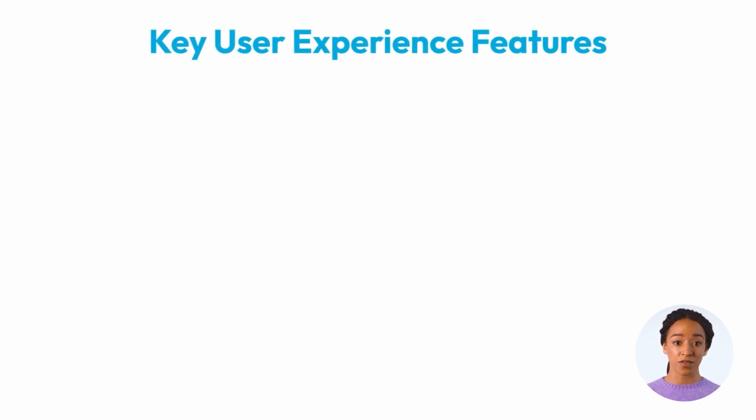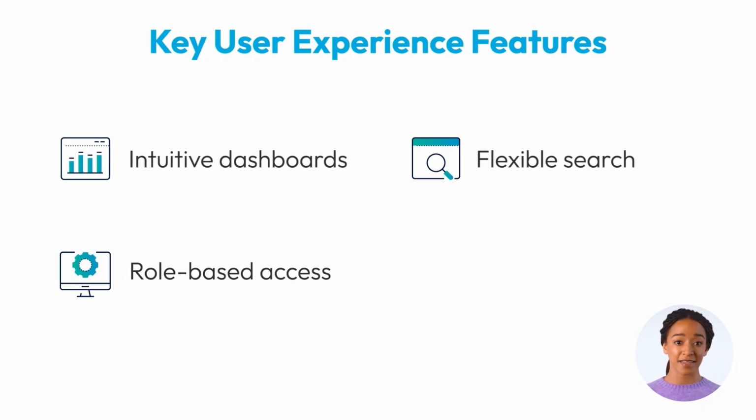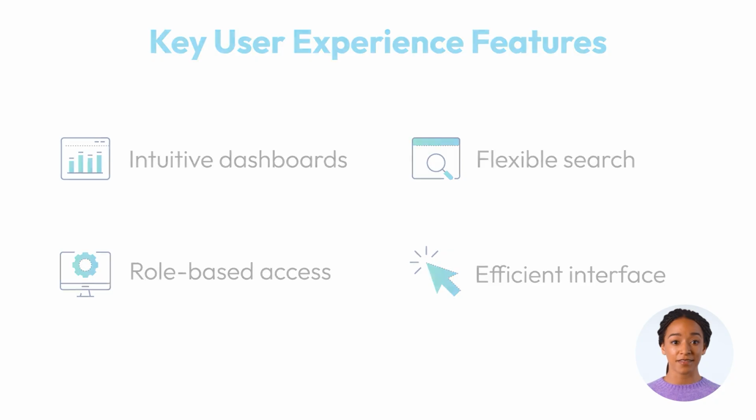Also, don't forget the user experience. A system that's technically capable but painful to use will hurt adoption. You want intuitive dashboards, flexible search, and role-based access that's easy to manage. If it takes 5 clicks to find a sample, your lab will be losing time every day. In short, don't just evaluate what the software does. Evaluate how well it does it and whether it fits your team's day-to-day needs.